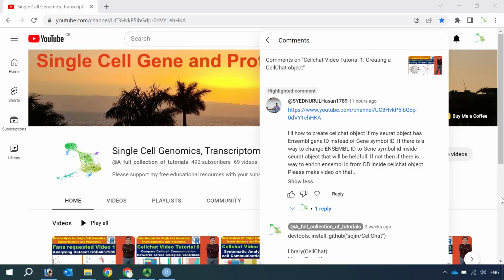Today I'm going to make a second fans requested video. From my comments, one of you asked me to help change Ensembl IDs in your Seurat object into gene symbols, because you are going to create a CellChat object from a Seurat object.